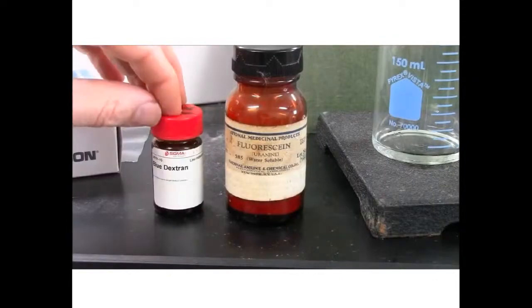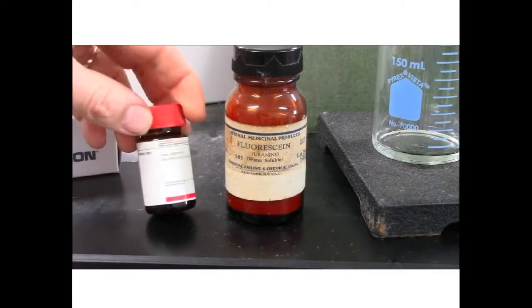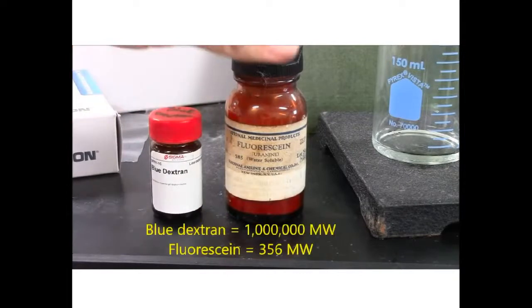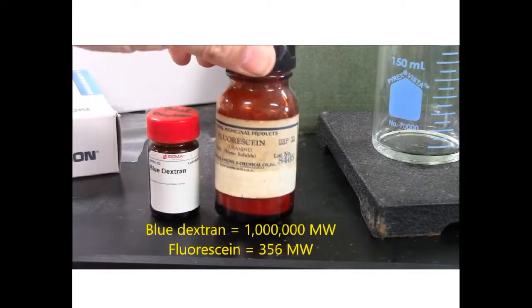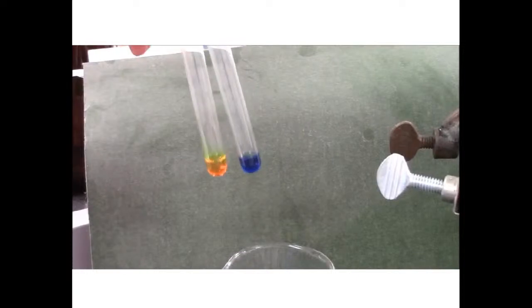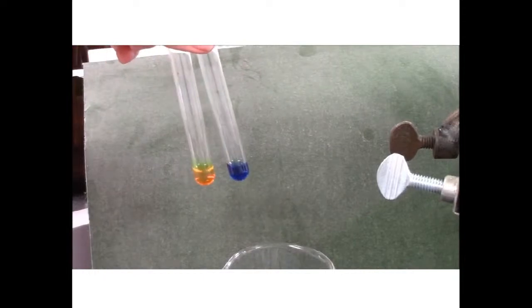I'm going to put a mixture of 2 molecules onto the column. Blue dextran is a very large molecule. It's a polysaccharide, molecular weight about 1,000,000. Fluorescein, on the other hand, is a small molecule, molecular weight about 350 grams per mole. I chose these 2 molecules because they're nicely colored, so I'll be easily able to see the separation visually as they go through the gel filtration.